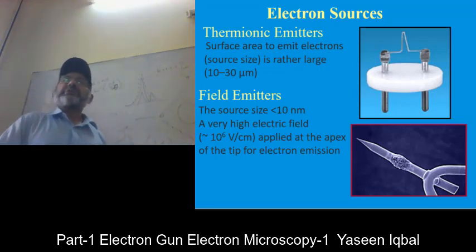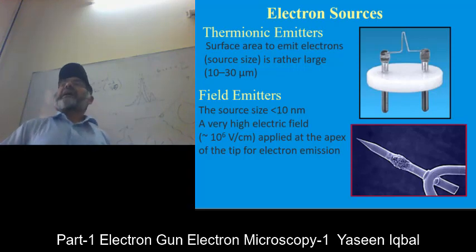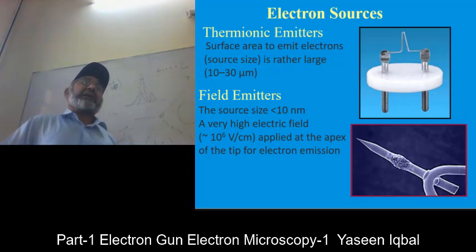What you expect from the electron gun is to happily and easily give you electrons.